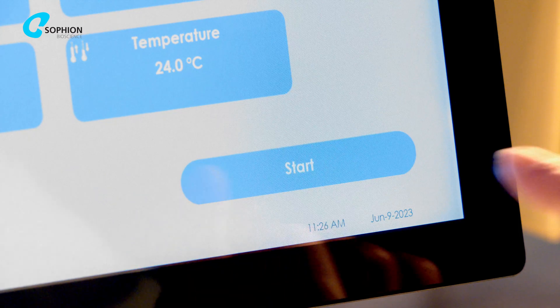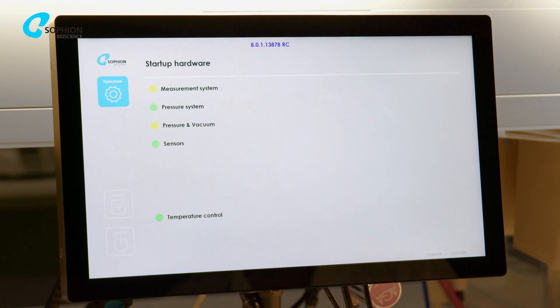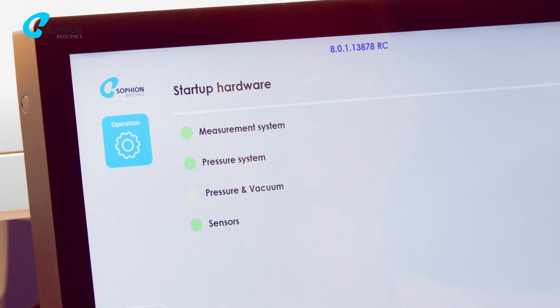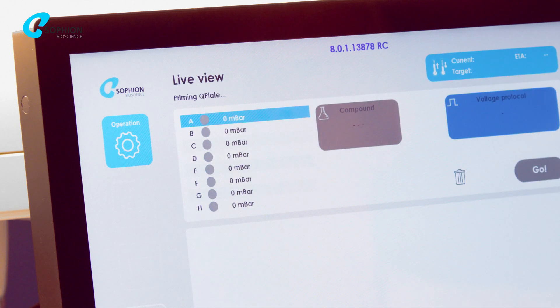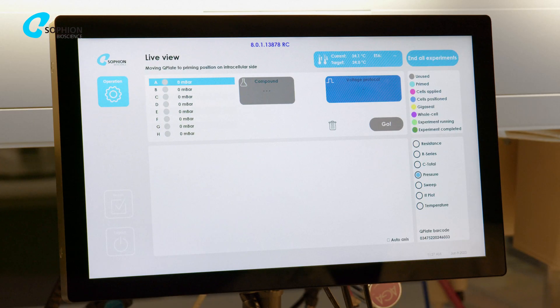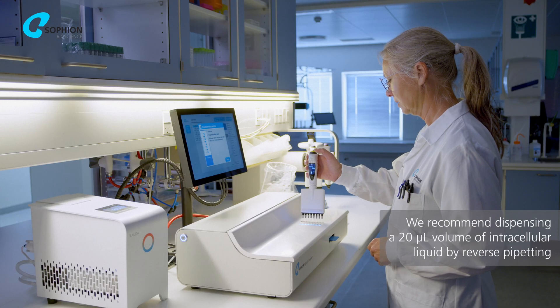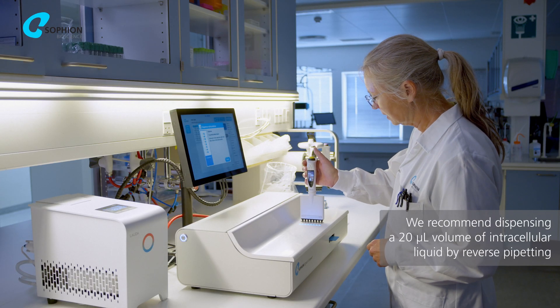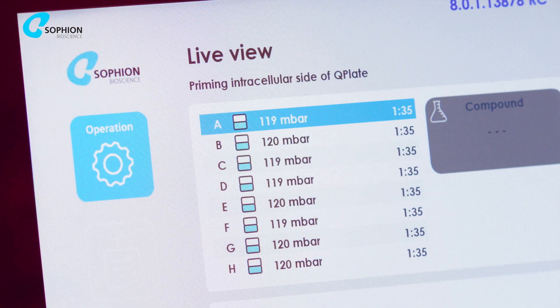Press the Start button. The instrument starts a hardware check to ensure all hardware modules are operational. Next, add intracellular liquid to the recording sites by reverse pipetting. Press the Done button, and the countdown will indicate when to proceed to the next priming step.